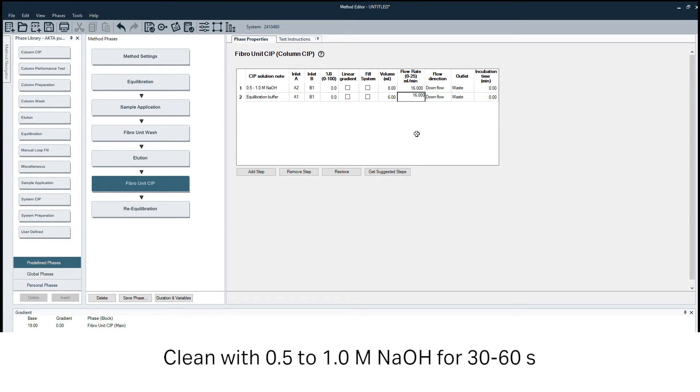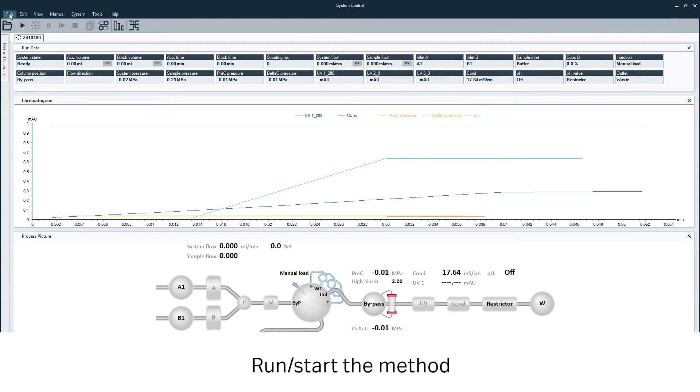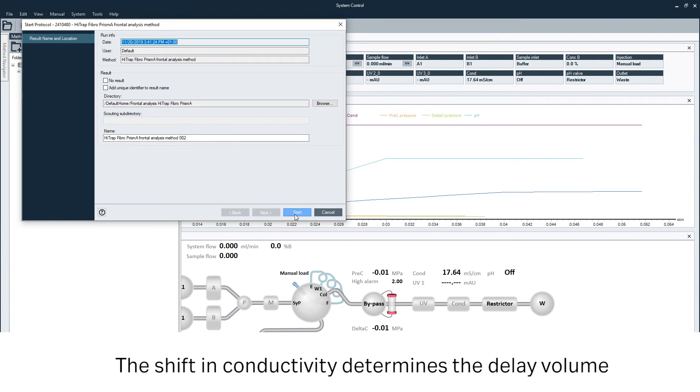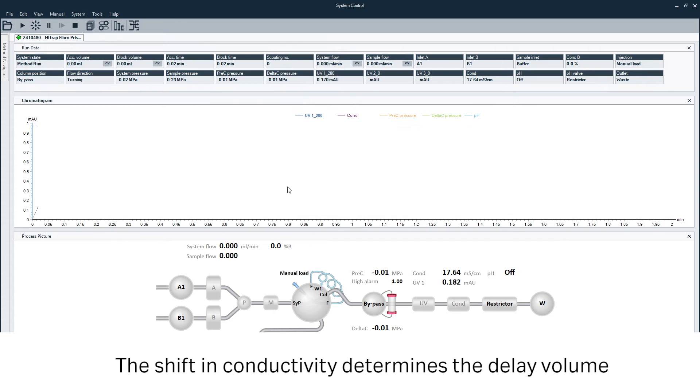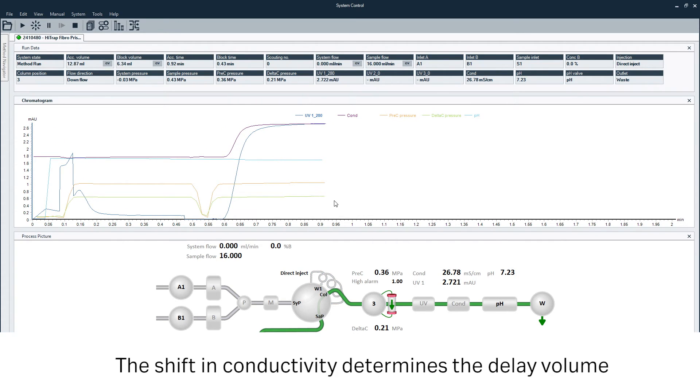Obtain the delay volume of the Fibro unit from the shift in conductivity during sample application. In this case, the delay volume is 1.78 milliliters.